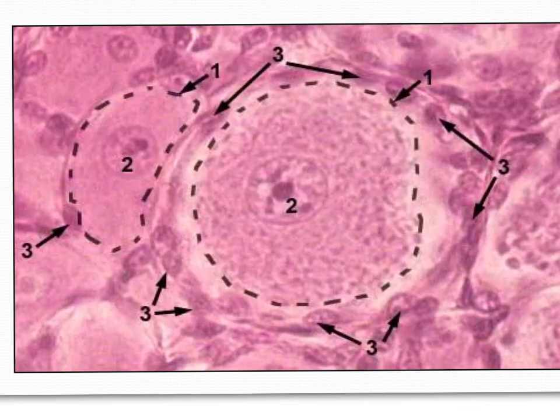This is the last picture in this trial exam. If you see here, we have number 1 here. Number 1 represents the body or the perikaryon. Peri means around, karyon means the nucleus, so it is the body of the nerve cell. Number 1, this area, is the body of the queen, separated from the servants by this space. So this is the body of the nerve cell or the perikaryon.